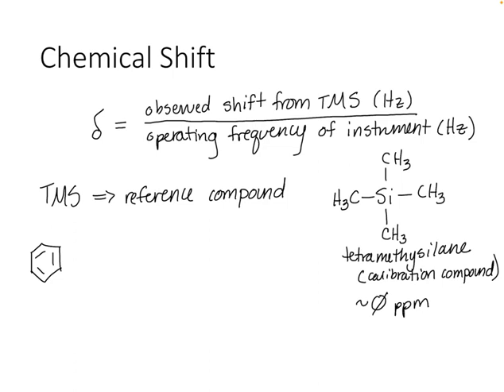Now, if benzene is being analyzed on a 300 megahertz instrument, then it's going to absorb a radio frequency of 2,181 hertz larger than TMS.